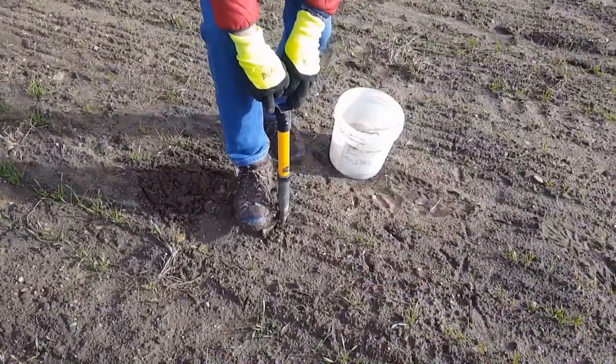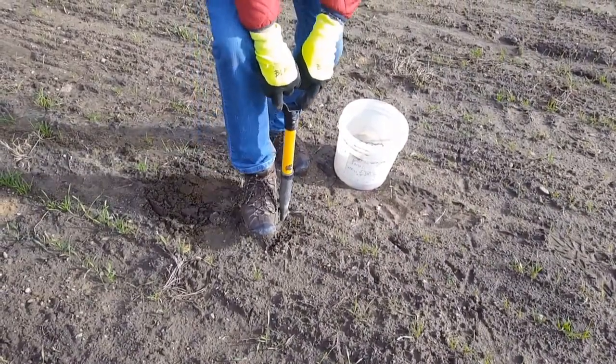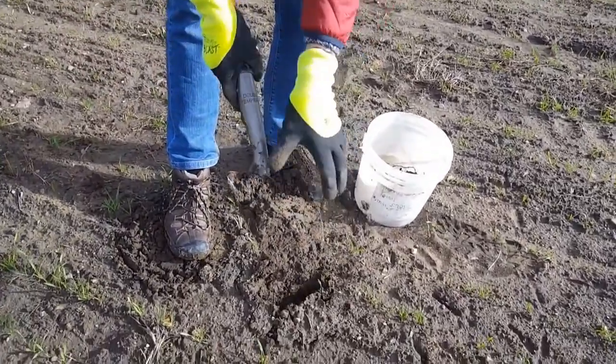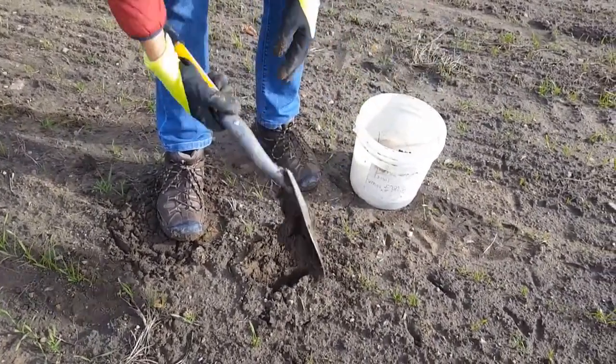Push the shovel down and pull it straight out. Make another vertical slice an inch or two behind the first and angle the shovel back to pull out a slice of soil. Remove the top inch of soil and then take a vertical section of the slice to make one subsample.